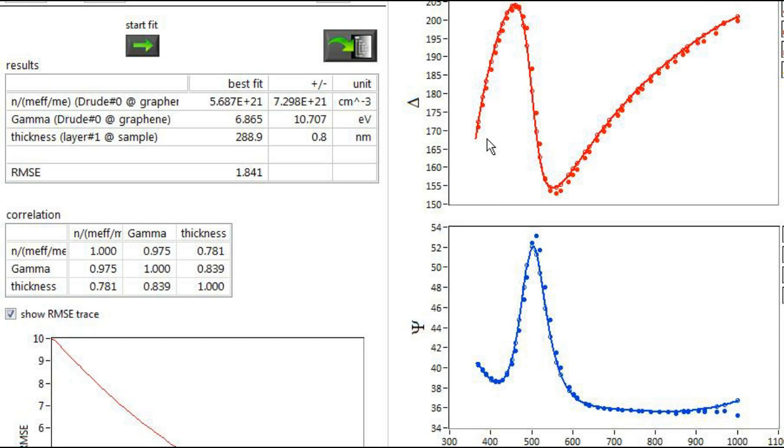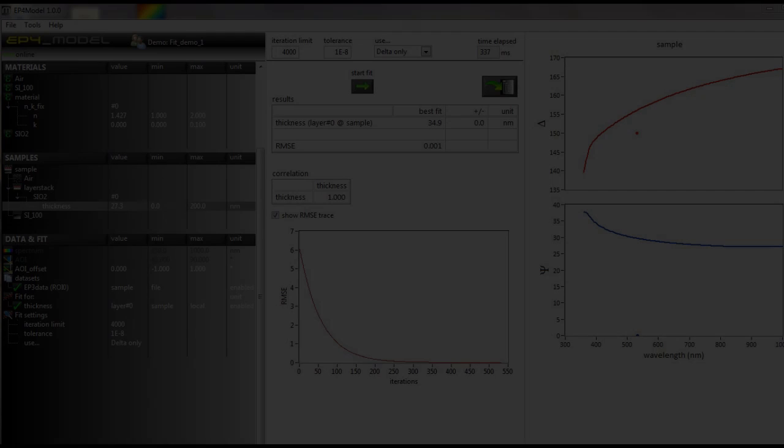Beneath the results, the root mean square error, as well as a correlation matrix of all results, will also be displayed to show you the confidence of your results.